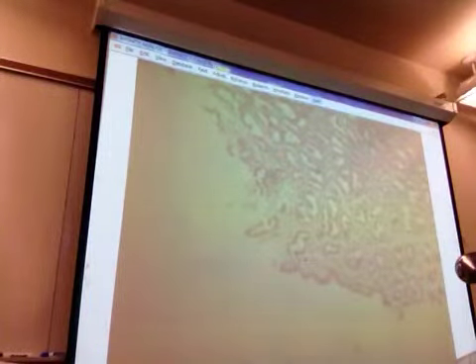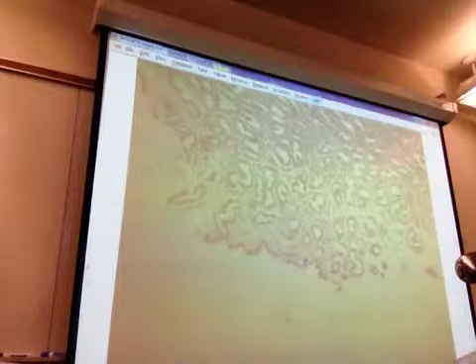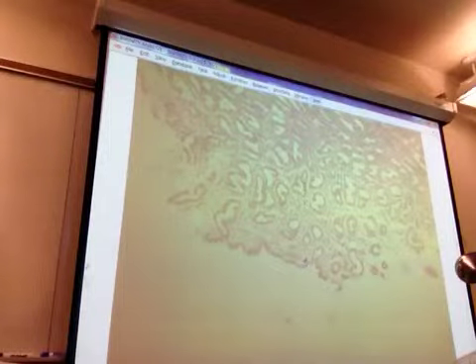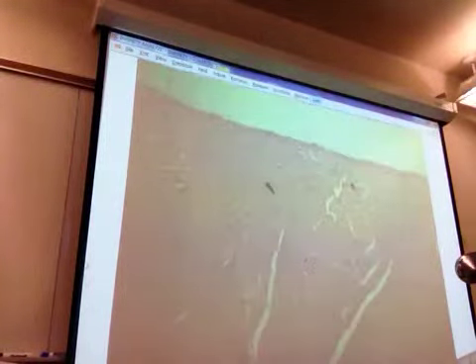Hey, what phase is this, people? Secretory. Yeah. No. Menstrual? Wait. So start up here. What's this? Okay, and myometrium. It's myometrium.